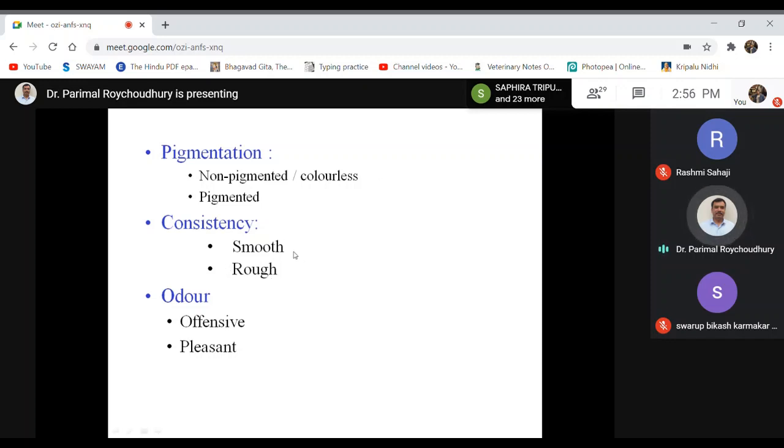there are certain bacterial colonies which are butyrous in nature, just like the feeling of taking some butter from a block of butter with a spoon. If you can easily take out the butter, we call it butyrous consistency, whereas there are certain organisms which always produce very sticky colonies. Even certain organisms produce powdery colonies, where if you try to pick up with the inoculation loop, the whole colony breaks. So that's consistency, and lastly it is the odor.